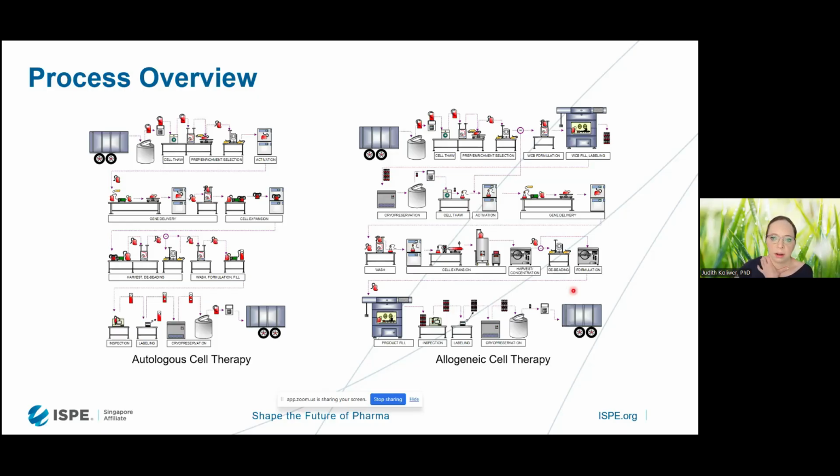So I think a lot of the equipment vendors really provide small scale bioreactors and basically provide us with the promise for a scale up rather than actually already having a lot of experience, at least from our group. So this is really where we see right now the scale of around 1,000 liters.